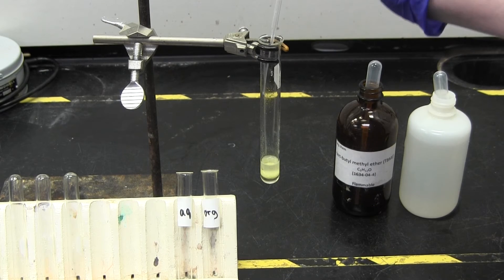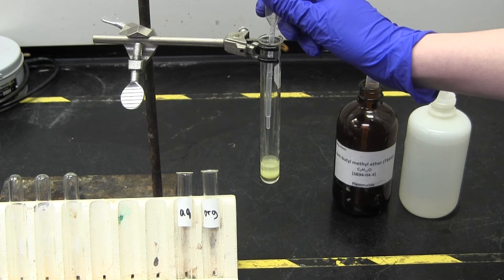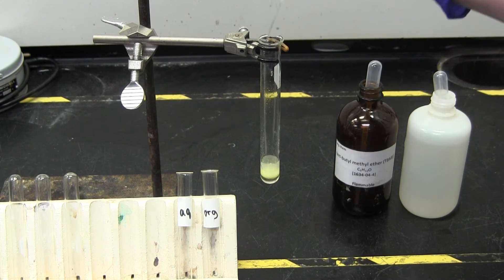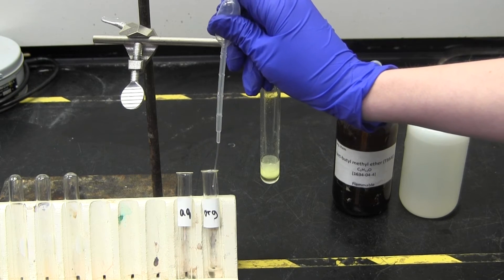Here are some tips for successful separation. First, most students find it easier to remove the top layer and leave the bottom layer behind. Make sure to keep track of which layer is which. If you forget which is which, then add a little more ether to figure it out.